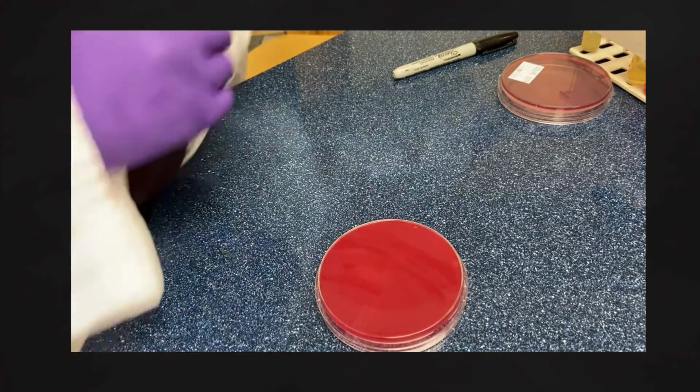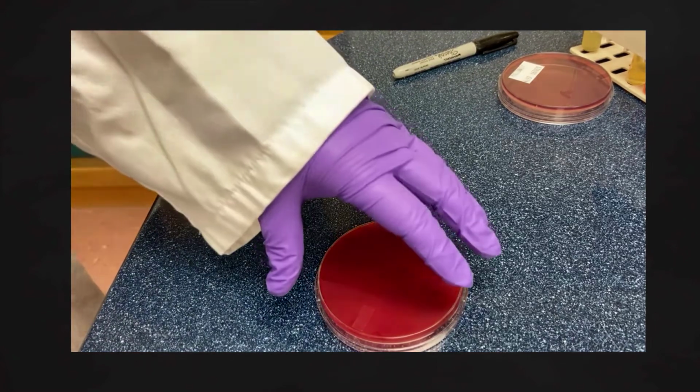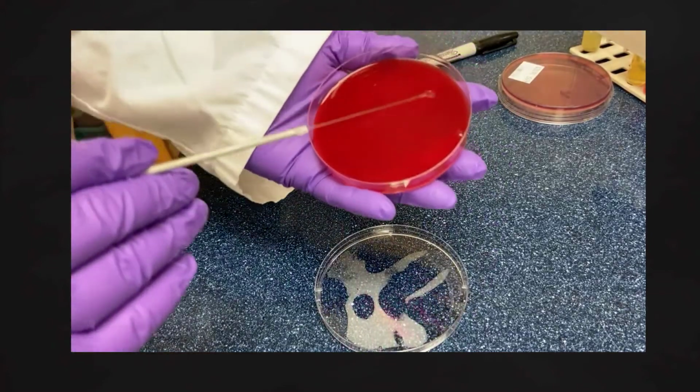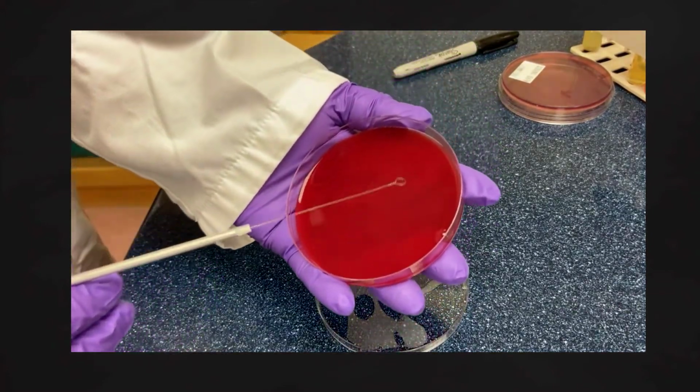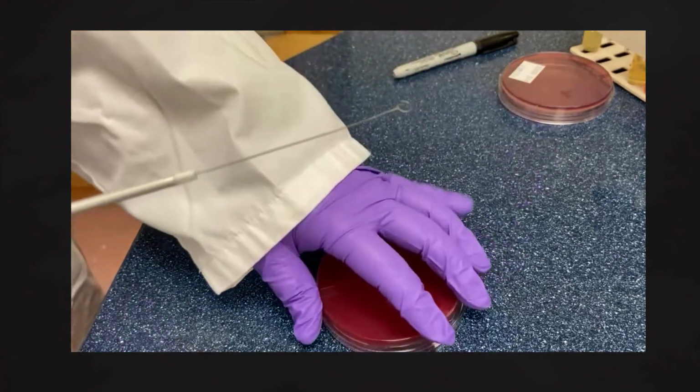Okay, so I have to re-sterilize between each of these quadrants. This time I'm going to pull from quadrant 2 into quadrant number 3. So I'm going to pull from 2, you can see the little zigzag there, and I'm going to zigzag into quadrant 3.